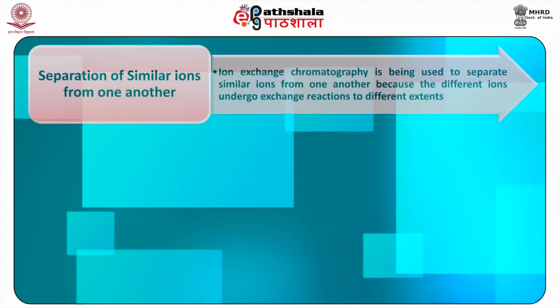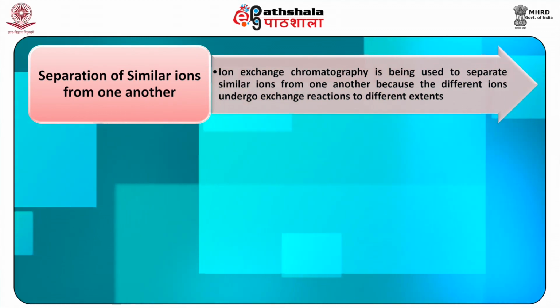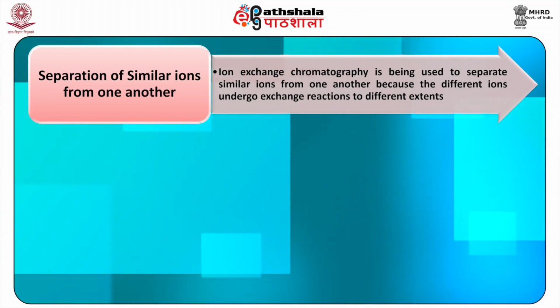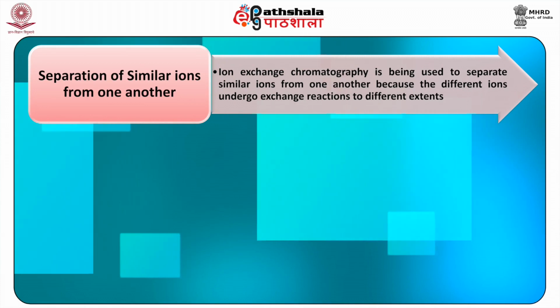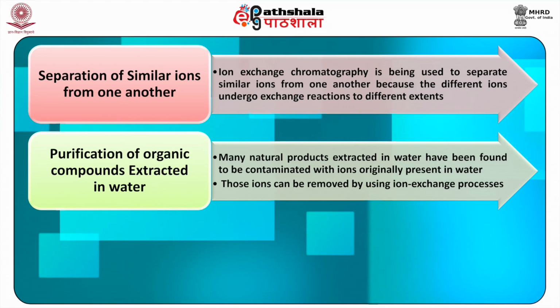Some applications of ion exchangers are as follows. Firstly, separation of similar ions from one another. Ion exchange chromatography is used to separate similar ions from one another because different ions undergo exchange reactions to different extents.